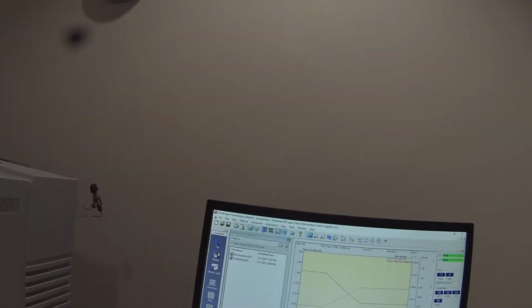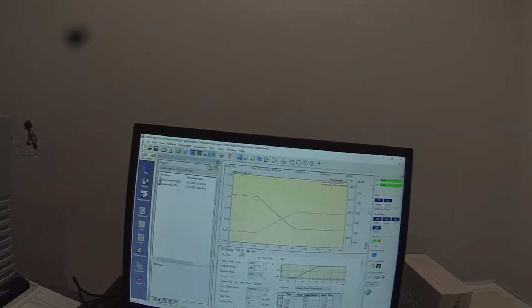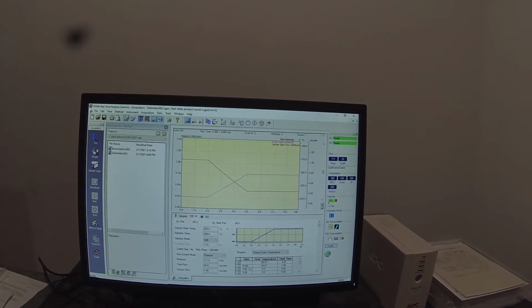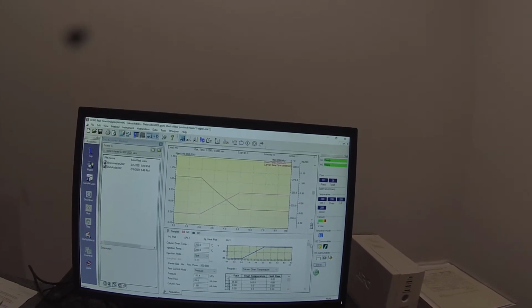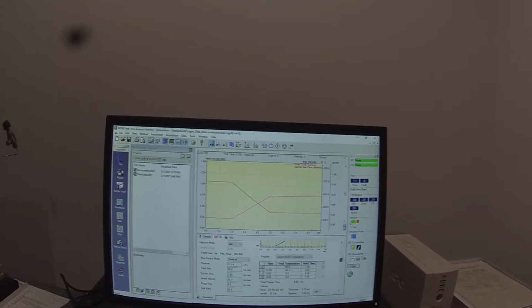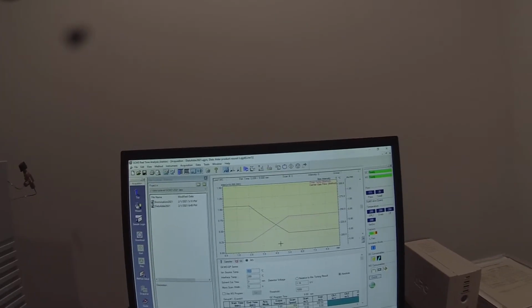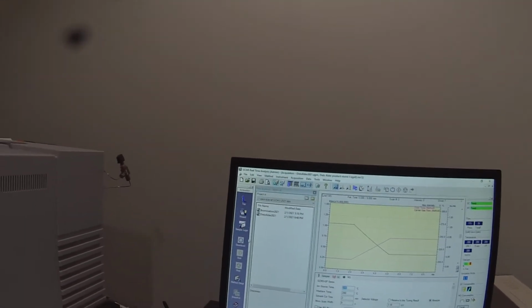So we're going to use the Diels-Alder 2021 method, which starts at 200 degrees and holds for 2 minutes, and then rises at 15 degrees C per minute to 245 and holds for 4. So that's a 9-minute run. We have a solvent cut time of 2 minutes. And hopefully our compound will come off in that range.